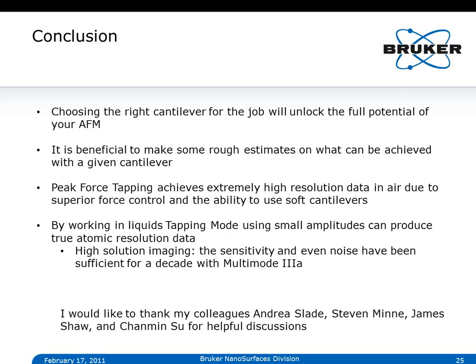So what comes out of your lock-in amplifier is not the signal from a single tap. It's the average over a large number of taps, depending on what time constant you set on your lock-in amplifier. So not only are you not able to look at a force directly, you're also not looking at a single tap because you're averaging at the same time. And you have to separate these things from using a tip.